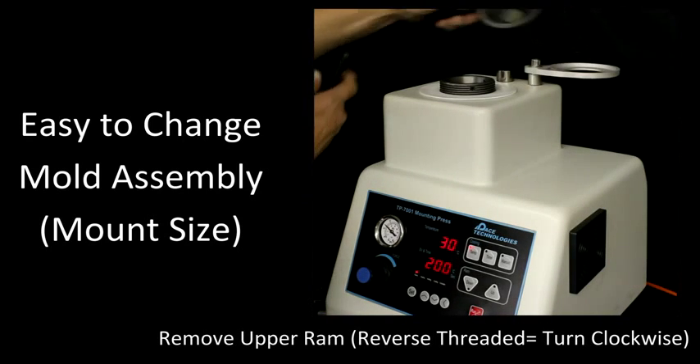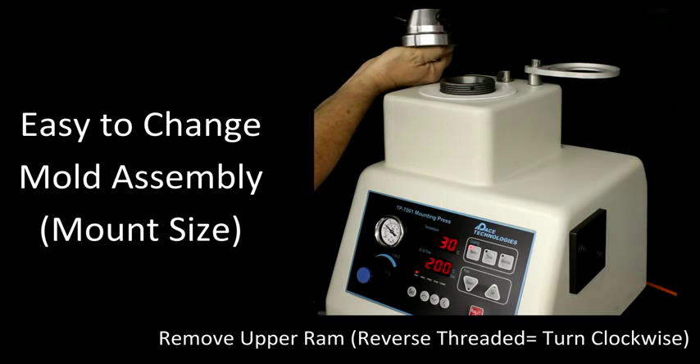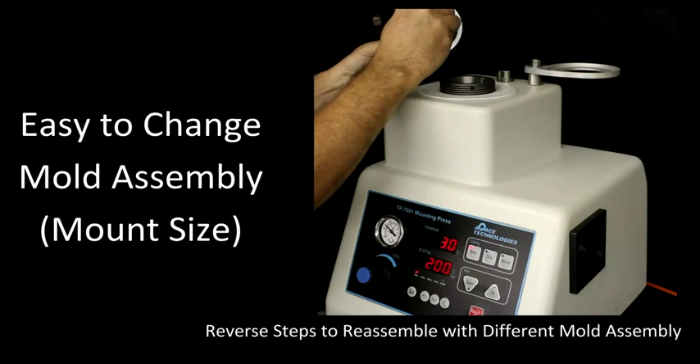The next step is to remove the upper ram. Now this is reverse threaded, so to remove it you have to turn it clockwise. Now to reassemble, just reverse those steps.